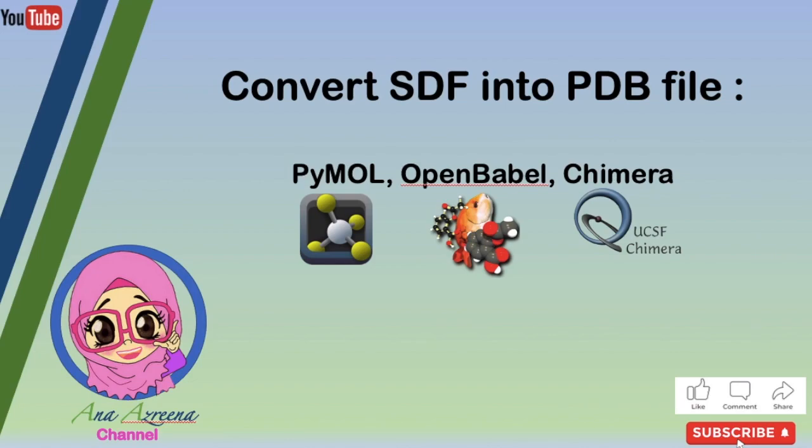Assalamualaikum and hi everyone. Today in this tutorial I will share how to convert SDF into PDB file using PyMOL, OpenBabel, and Chimera. Most ligand structures are in SDF, therefore we need to convert it into PDB file for docking analysis.